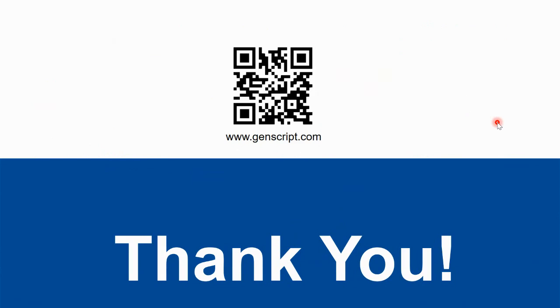So generally, we are able to achieve a library of approximately 10 to the power of 6 to 10 to the power of 7 using a high copy number of the plasmid. When necessary, we can try to scale up from 10 to the power of 7 to 10 to the power of 8, but this is the maximum that we can achieve so far. However, on the other hand, if the clients prefer the PCR product as the final end product, the maximum library size that we can reach, as far as I know, is 10 to the power of 11.